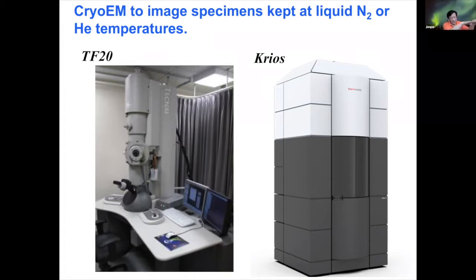As I mentioned, because of the retaining of the atomic resolution information of the specimen, the micrographs contain high resolution information. This can then be used for computational analysis.